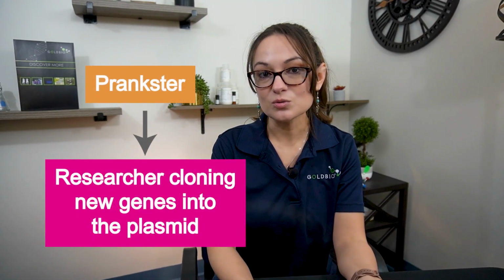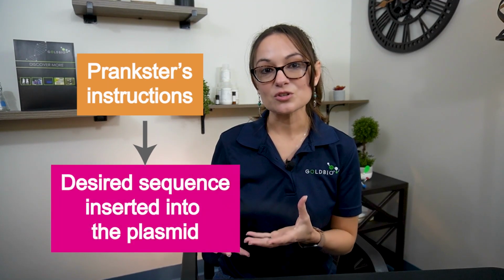When you and your friend put each of your sections together, it's like the missing piece is uniting with its other part. Then there's the prankster, and this would be similar to the researcher who's cloning new genes into the plasmid. And the prankster's instruction that they inserted into the manual would be the desired genetic sequence a researcher is trying to insert into the plasmid. When the researcher inserts their instructions into the plasmid, they do it in a way that disrupts the sequence for the alpha peptide. And when that happens, the alpha peptide won't actually get produced. Again, very much like our prankster who wrote in their own steps in the middle of the manufacturer's instructions.